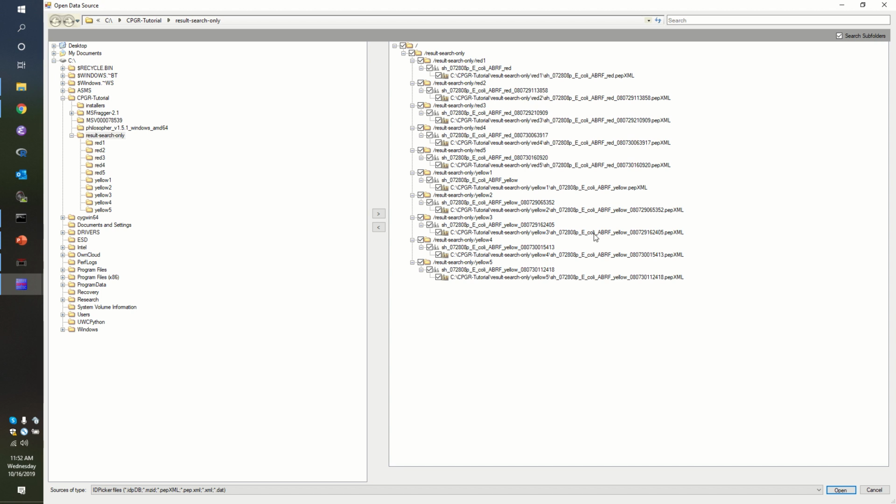All right. So I'm telling it that I want to process these 10 input files as one big experiment. Okay.